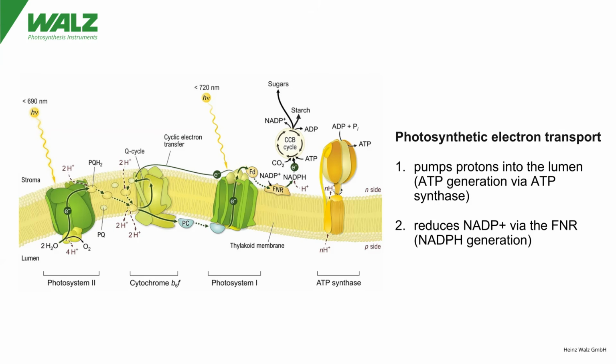There are two types of photosystems, Photosystem I and Photosystem II. At Photosystem II, the replacement electron comes from its water-splitting complex. The water-splitting complex splits water molecules into oxygen, protons, and electrons. The protons are released into the thylakoids.